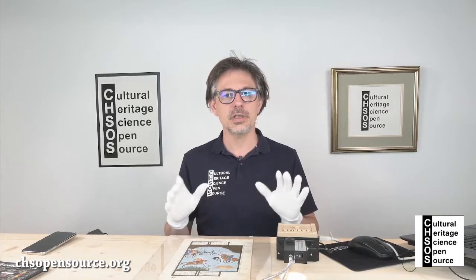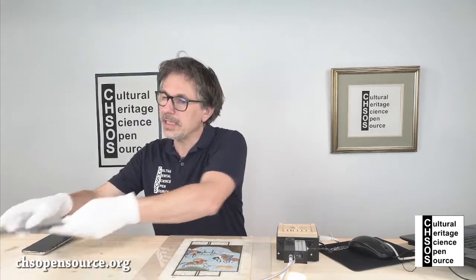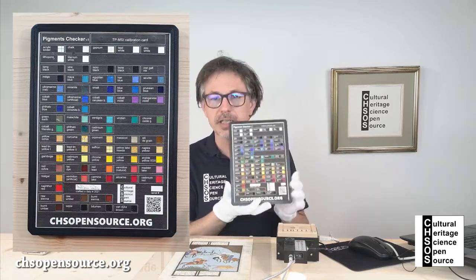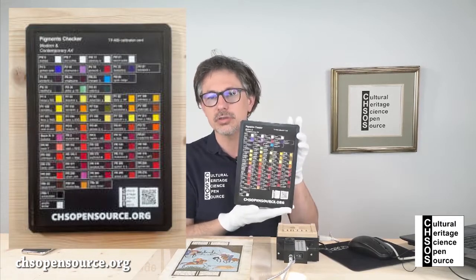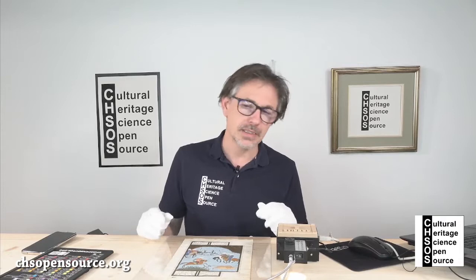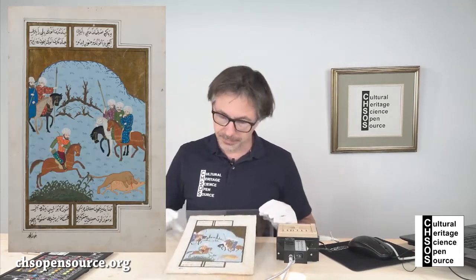Class, we're going to show how to use the Gorgias spectrometer and the data that we can have from the pigment checker, the standard version, and the new pigment checker modern and contemporary art. We're going to test this system on this manuscript.